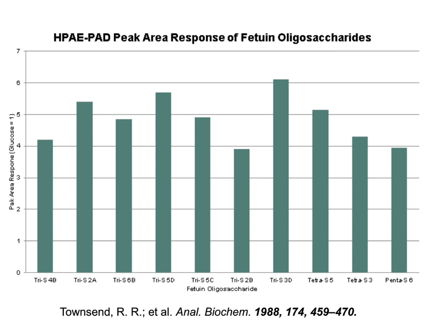Now, these experiments are pretty hard to do. You've got to know that you have the exact amount of glucose you think you have. You also have to have a pure oligosaccharide. You have to know how much of that oligosaccharide is there. You've quantified that probably by monosaccharide analysis. So there's a lot of error involved in even doing this experiment. Each of these have been injected a couple times.